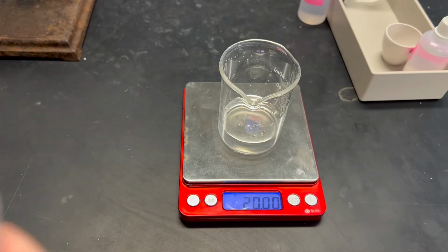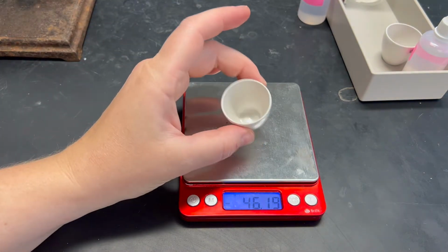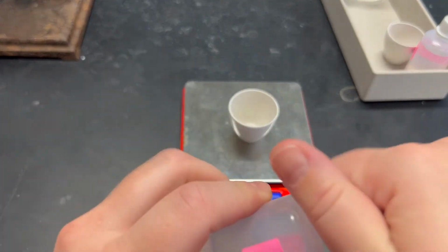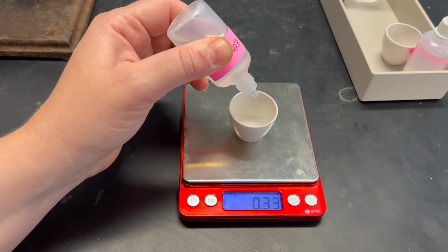Cap up your bottle, put that aside. Your water is going to be put aside for now. And now we're going to measure out into our crucible 2 grams of ethanol. So take your ethanol dropper bottle and add in ethanol until you get to 2 grams.